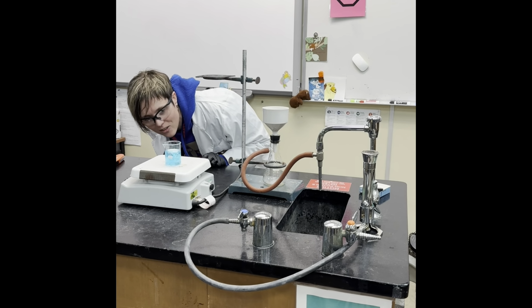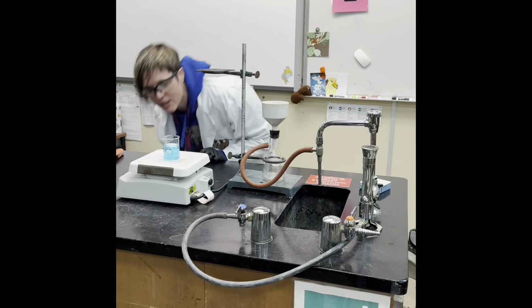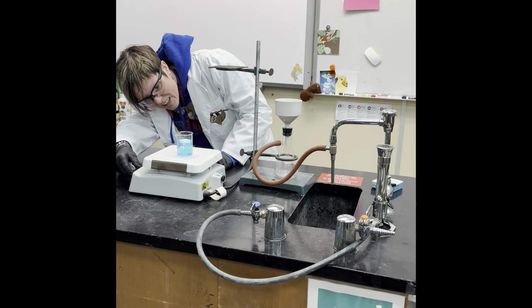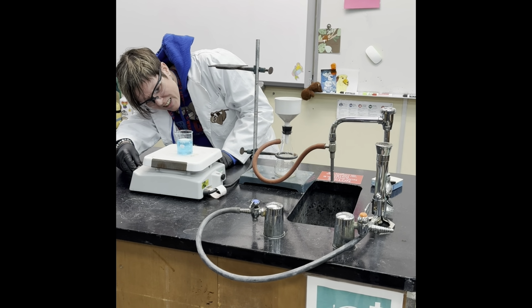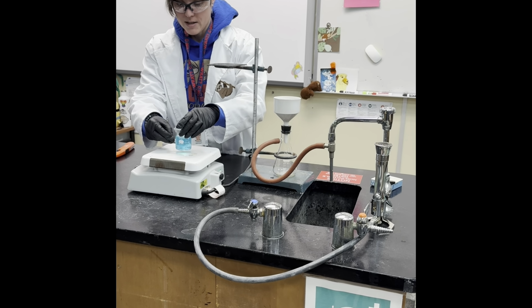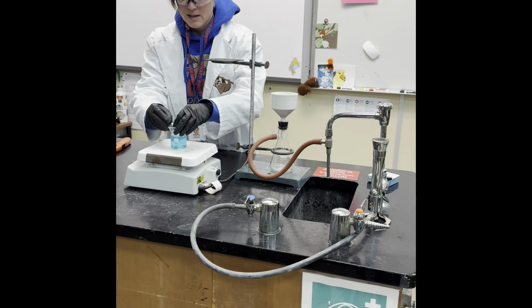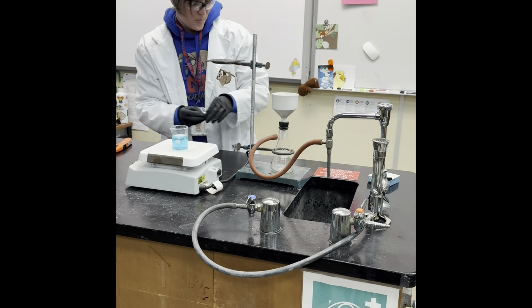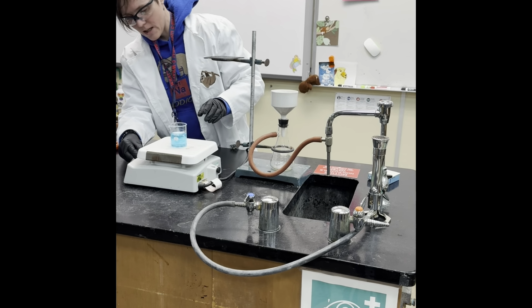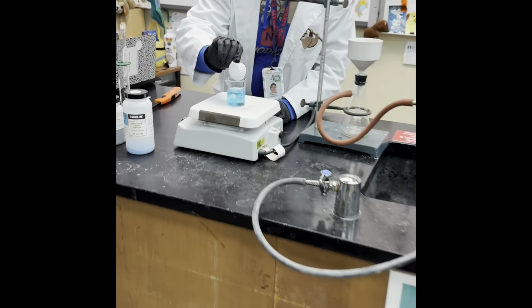All right, it's looking like that is pretty well dissolved. I'll stop the stir and check it. Yeah, looks pretty good. So I'm going to remove that stir bar because I don't want to get all the product gunk on the stir bar. Okay, all right, so I'm going to keep the heat going, and I'm going to add the iron.